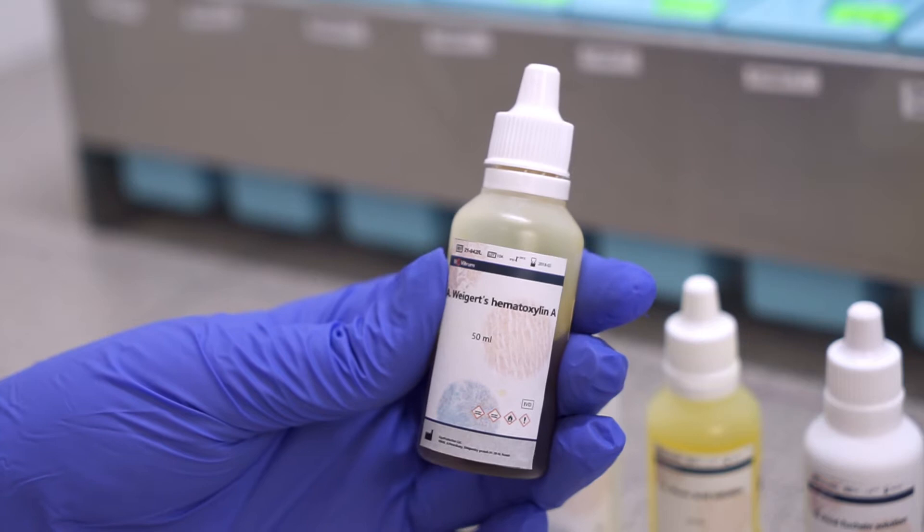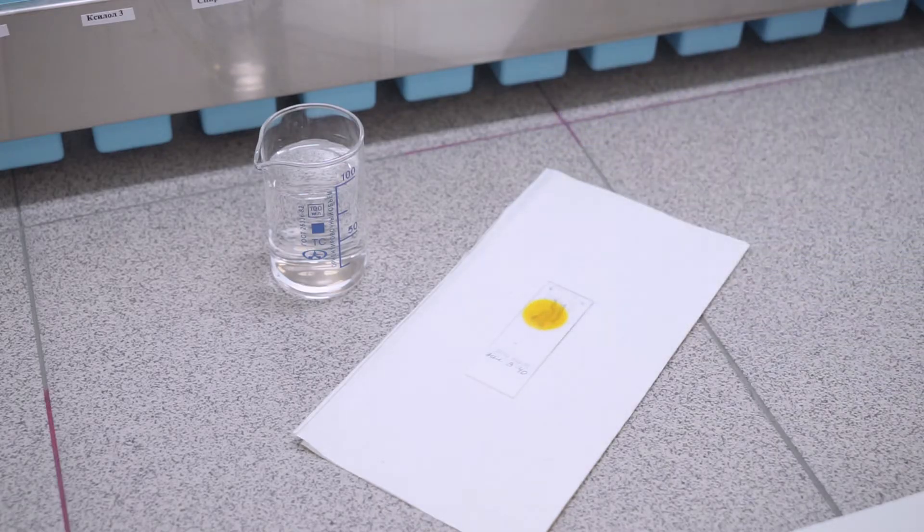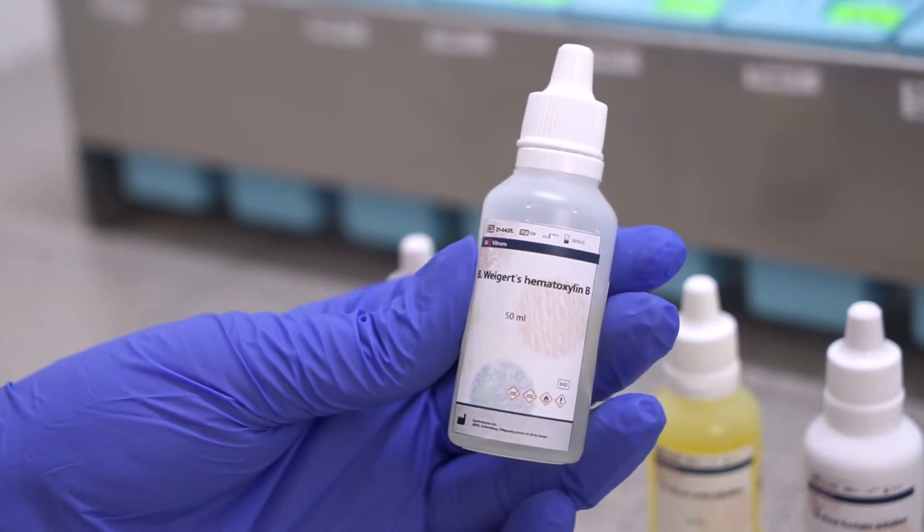On the first step we use Weigert's Hematoxylin for 10 minutes. We prepare it as a mixture of solutions A and B right before staining.